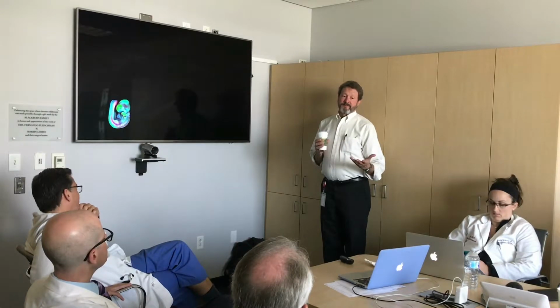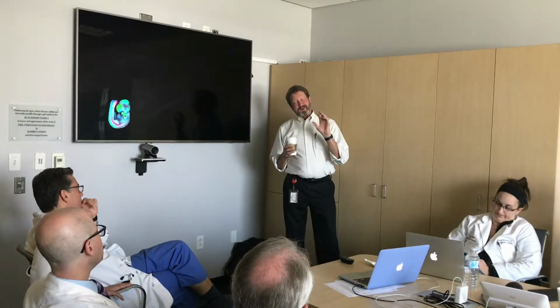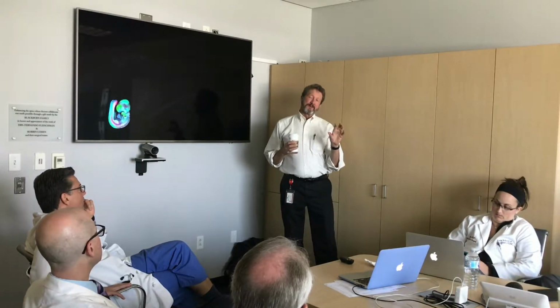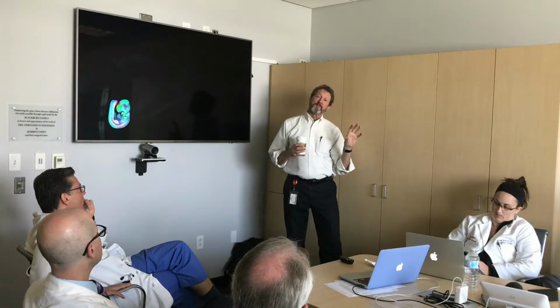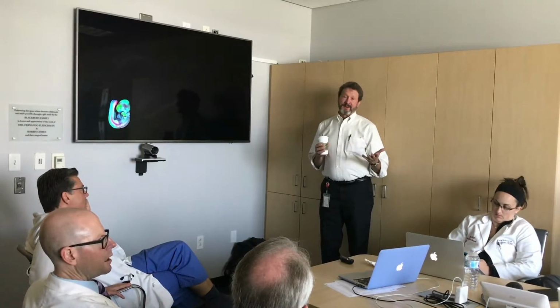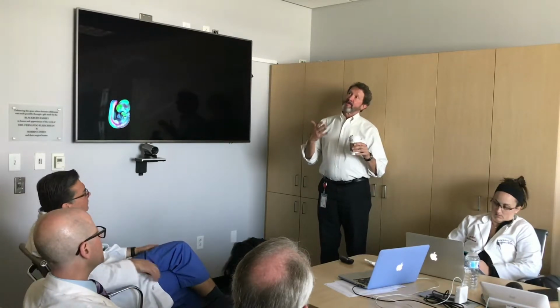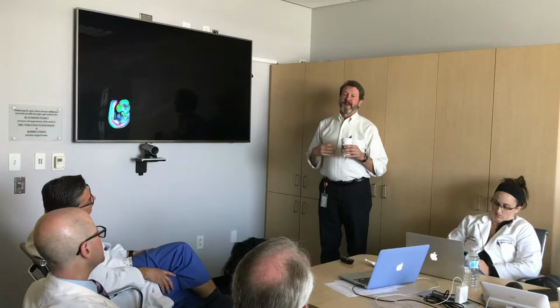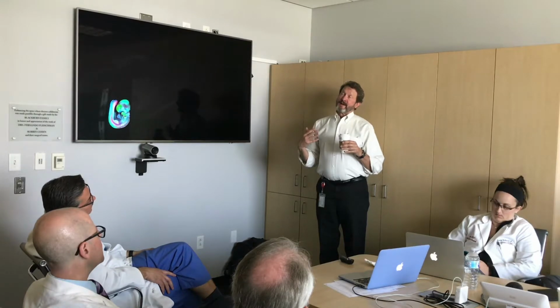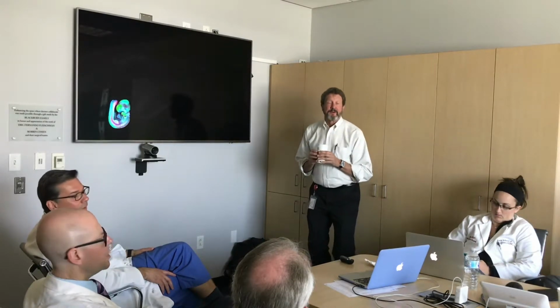In the third hour of my talk, I could tell you about our imaging of the beating heart and watching blood cells inside the heart. So we're trying to exploit what other people would consider autofluorescence or absorption by the blood, that signal. If we can exploit anything about it using these tools, we can see it. If the optical path is too challenging, then we might have to think, if it was on a guide wire or something, about doing a flush of saline or something of that sort to get rid of that signal. Or a balloon. Yeah, or a balloon, right.